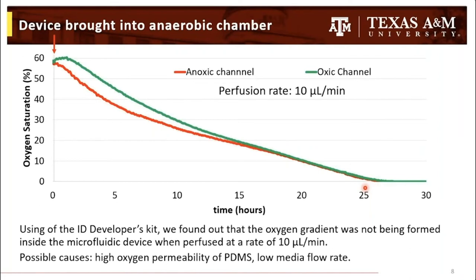Now, there are two possible causes for this unexpected result. The first one is the fact that PDMS is highly permeable to oxygen. If you combine that with a relatively low media flow rate and the consequent high residence time of liquid in the system, these two things merge, and the consequence is that the oxygenated water that we were injecting into the device was losing all of its oxygen before it could reach the co-culture chambers.